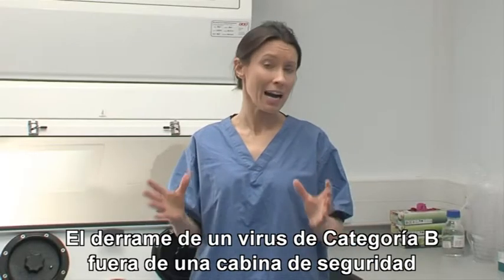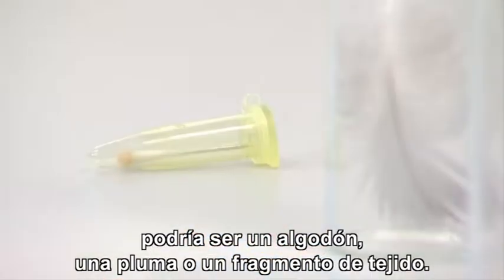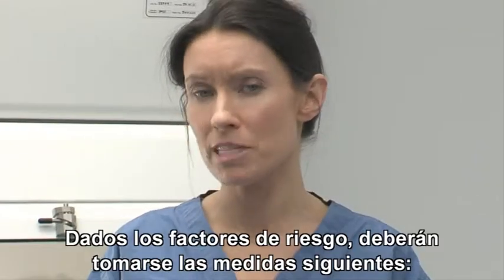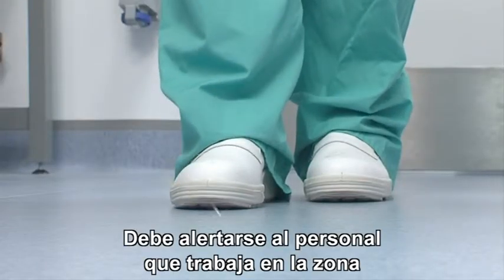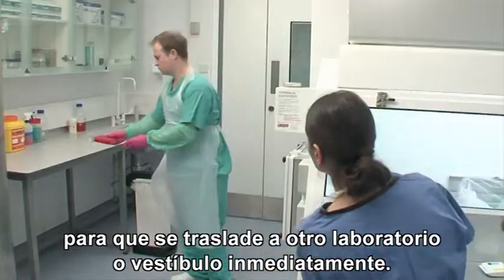A small spill outside a safety cabinet of a Category B virus might include a swab, a feather, or a small piece of tissue. Given the risk factors, the following procedures should apply. Alert all staff working within the area to move to another lab or lobby immediately.